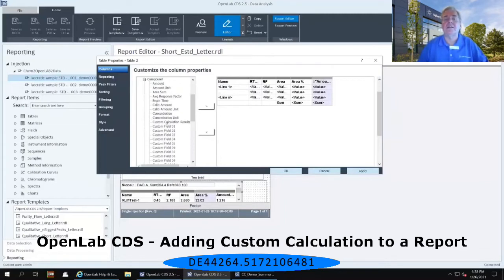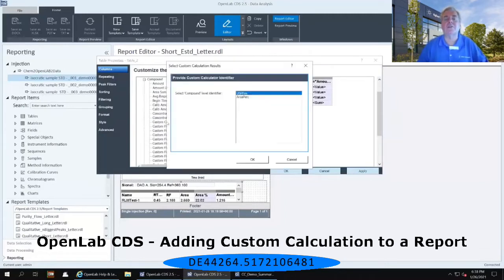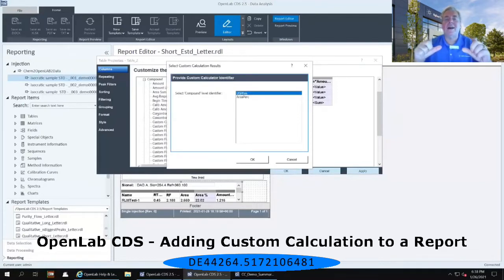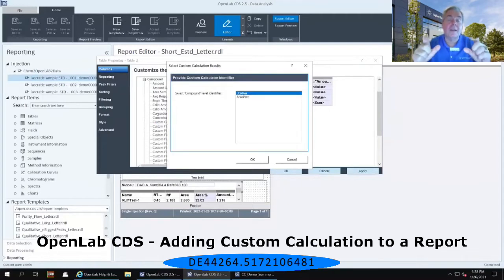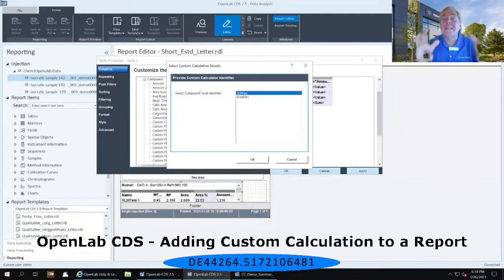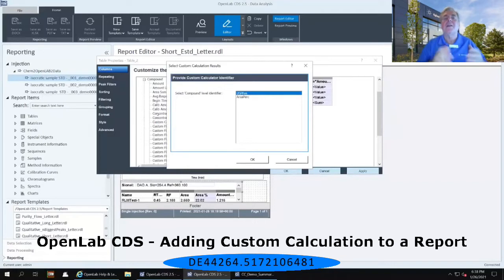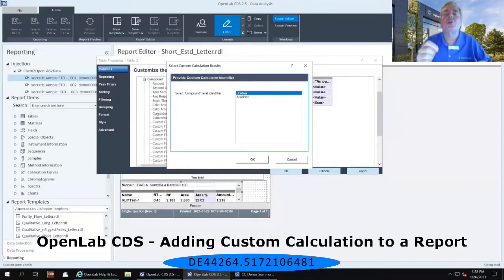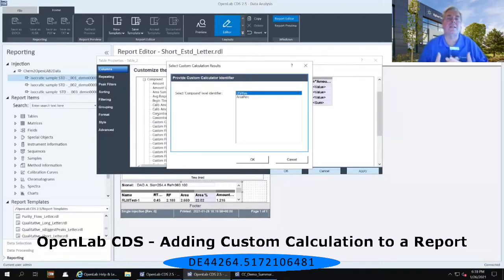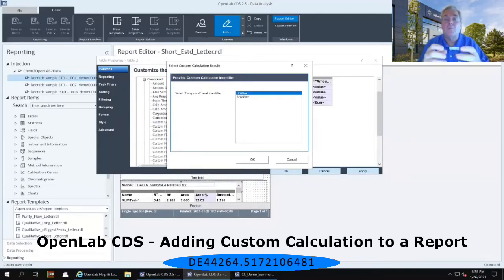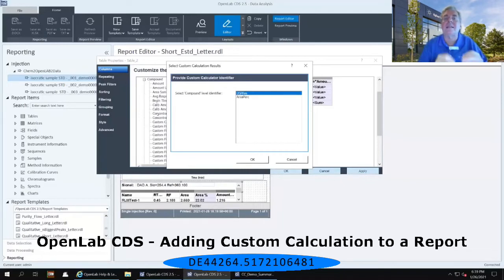Double click on that custom calculation results, and notice that we have the two named custom calculation files or two named custom calculators that we did in our previous exercises. This is why it was very important to, for me at least, to rename those instead of CC file number one, CC file number two, to name them something that would make it clear to me what this is.